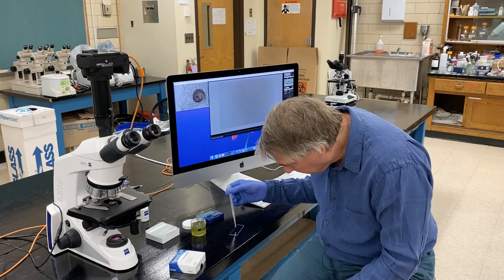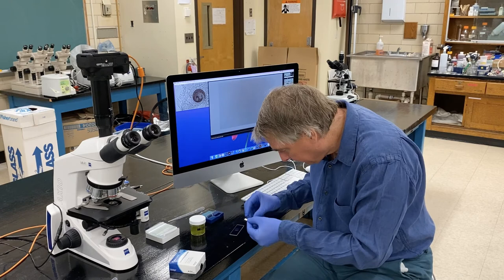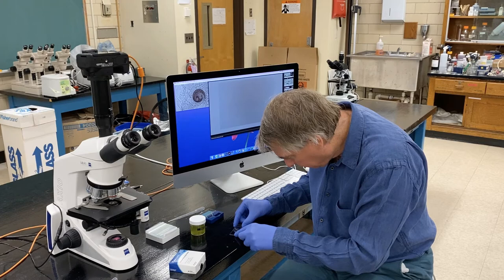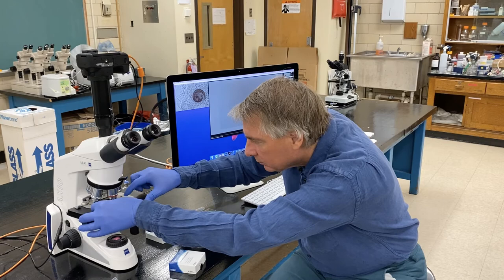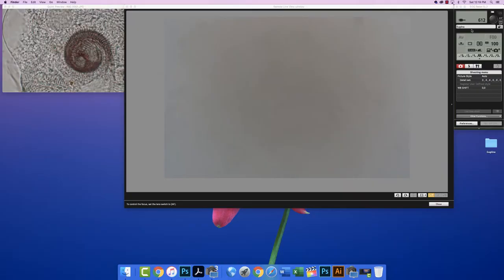It's one drop. Cover slip. And just set this on the microscope. And then we have to focus. And there they are, Euglena.